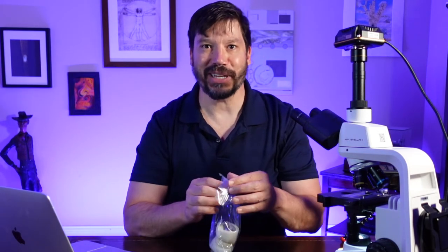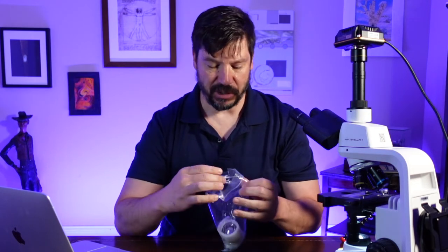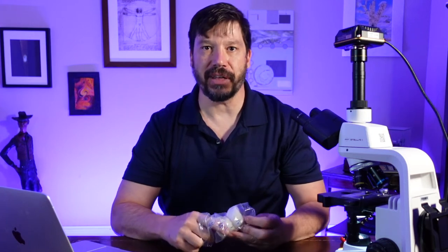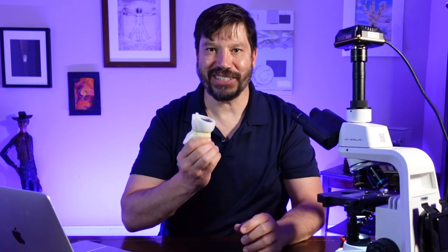The lenses come from Motic, which is the actual manufacturer of the Swift. So Motic lenses were a good place to start. Now, you never know how well these are going to work. Most notably, will these lenses be parfocal with the other lenses I have that are stock on the Swift Stellar 1 Pro? And I'm pleased to say that they are.